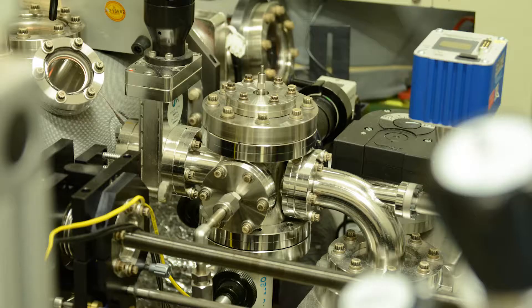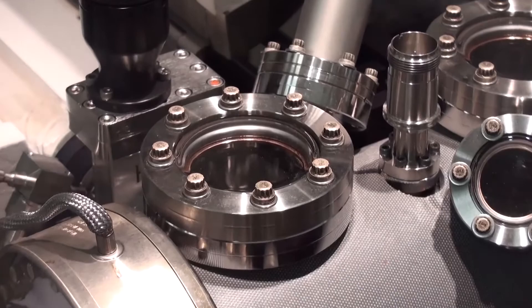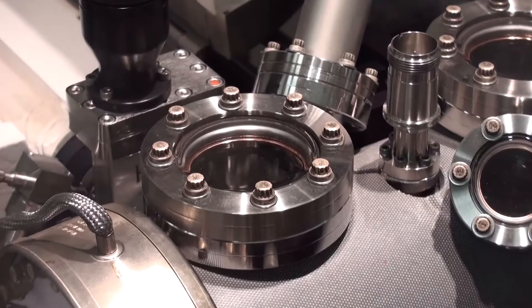We're providing chemical and bonding information that's really important to researchers that want to understand things such as carbon, nitrogen, phosphorus, sulfur speciation. So you're getting this information using a microprobe technique. So spatial information, chemical information, and quantification are the strengths of this technique.